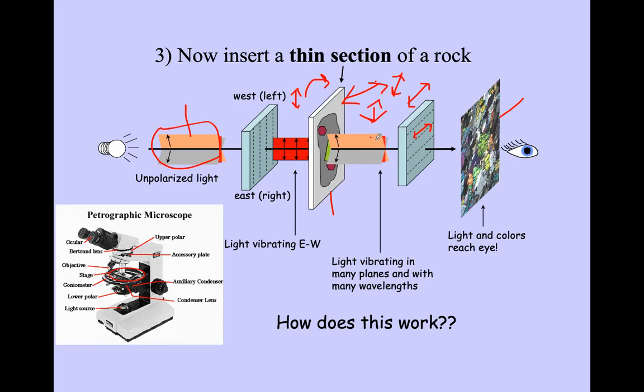So those components will be, for example, like this. This is the vibration direction of the second polarizer. But in case you had a vibration in this direction, then it will be transmitting the vibration direction parallel to this line, okay?